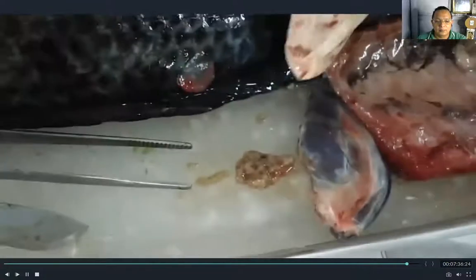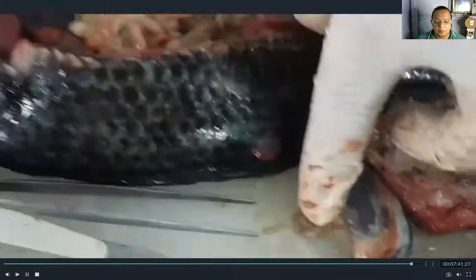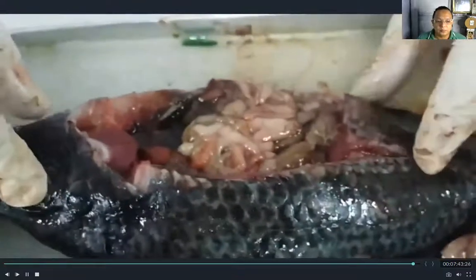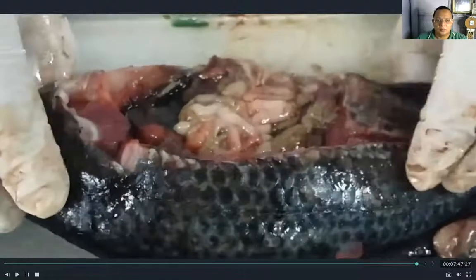Those tiny particles are the eggs inside the ovary. I hope you learned from this lesson.